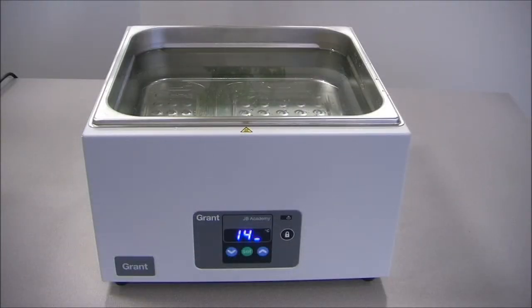This is the JB Academy. Aimed squarely at the educational market, it features a stainless steel tank and comes in sizes 5 to 18 litre. It'll heat up to 95 degrees C and features a front panel lockout to avoid any interference. It also features a fixed thermal cutout to guard against running dry.